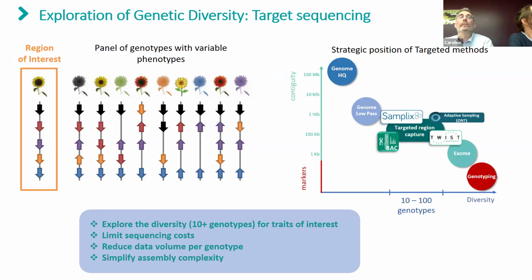And in that, we are talking about region of interest. When we are talking about large, it means more than 1 kb. It means something bigger than a typical PCR. So it's why it was important to develop this aspect, because nothing exists at this moment. And so when we are talking about that, we are in the middle here.